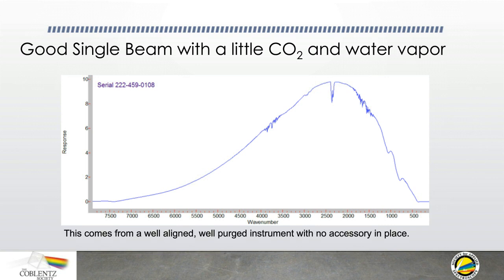All right, thanks, Ellen. There are a couple of questions on general FTIR use. And one of them is, should I keep FTIR running 24 hours or shut it down at the end of the day? And sort of related one is, should I purge the instrument with nitrogen to keep the instrument inert and dry? Okay, let's talk about shutting it down.